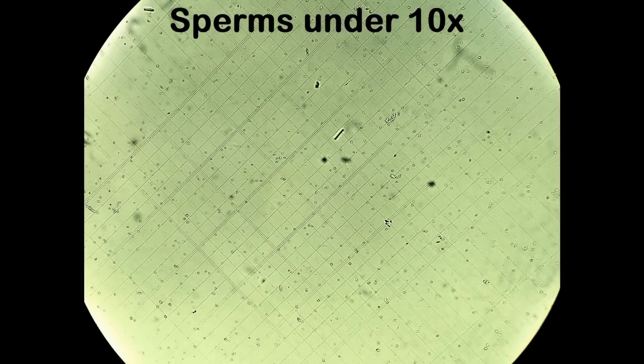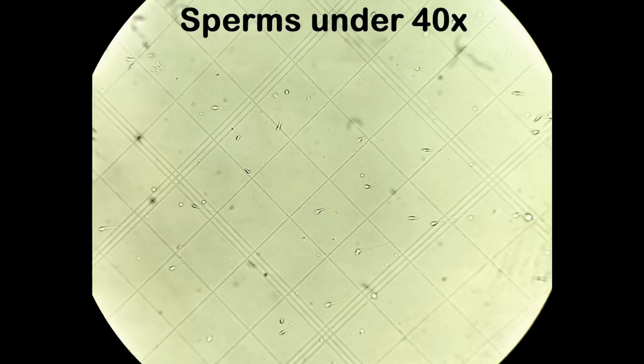This is how sperm cells will appear within the small squares of the counting chamber. Repeat the counting process in the second counting grid of the counting chamber as well. Take at least 2 readings for both counting grids and take the average of the readings.